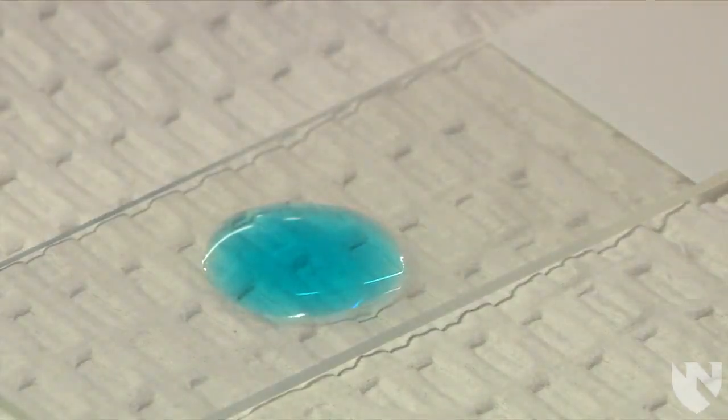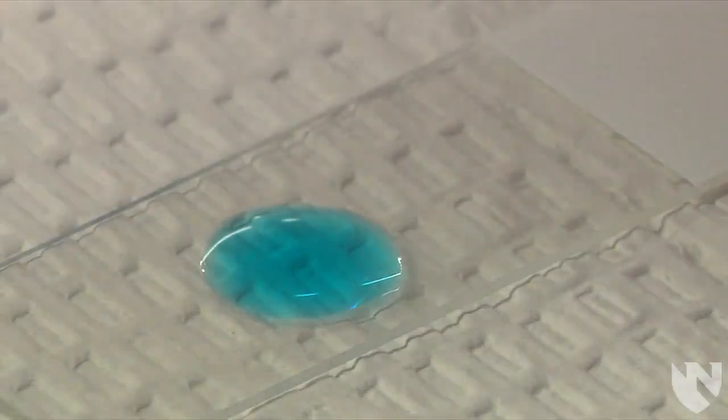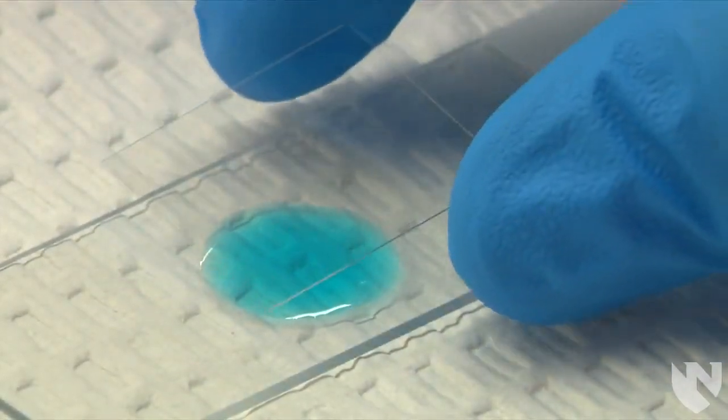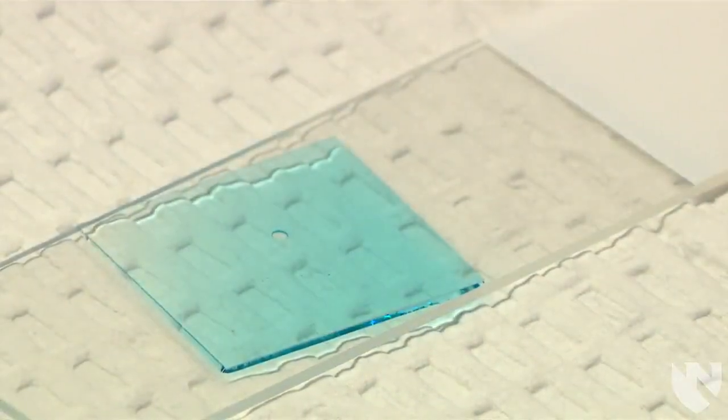If you dispense too much sample on the slide when you place the cover slip over the sample, it will flow out and cause the elements in the sample to float under the cover slip. So discard this slide into a sharps container and make a new slide.